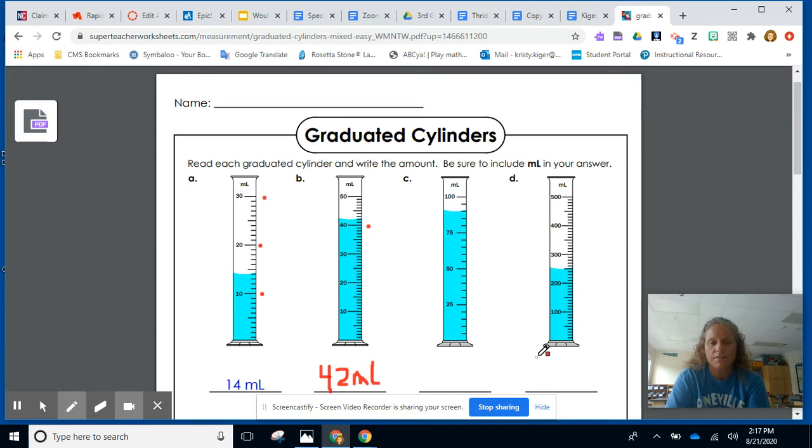Now I come over here to this one. This one doesn't look the same at all. It goes from 25, 50, 75, 100. So this one is counting by 25s. So now we've got to figure out if this is counting by 25s, what does each of these little marks mean? Well, it can't be one, two, three, four, five. That says 25.